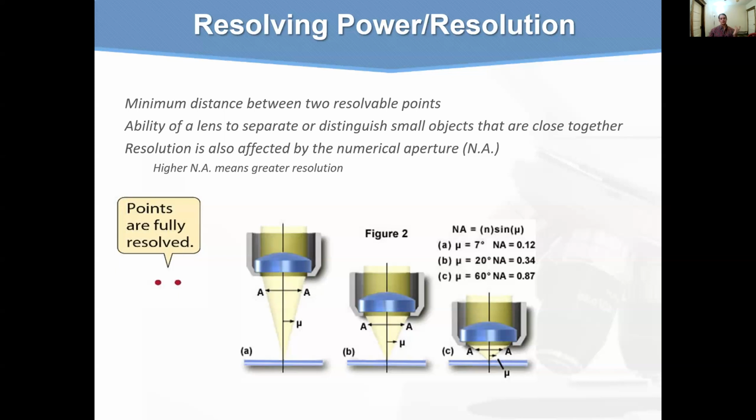In order to increase the effective aperture and resolving power of a microscope, a condenser is typically added. Remember, I showed you on that sketch the condenser below the specimen plate. This generates a ray cone on the illumination side of the specimen. This enables the objective to gather light rays that are the result of larger diffraction angles, increasing the resolution of the microscope system. So the location of the light source is purposefully there so that we catch more of the light coming from the specimen so that we can see more detail.